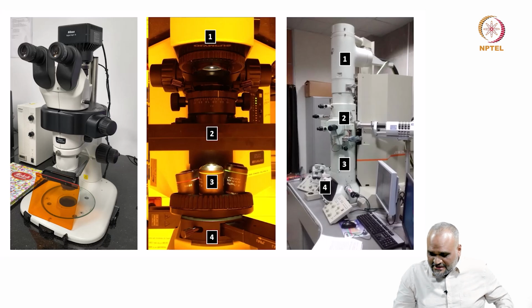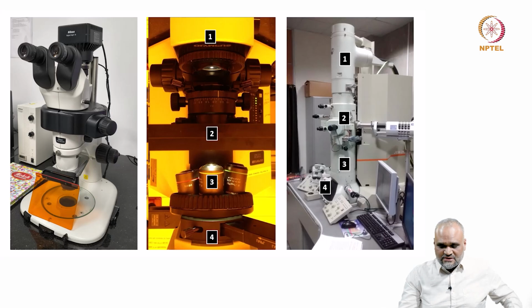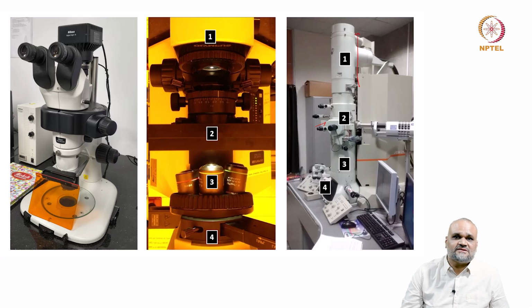Now, going away from that particular deviation, if I go back to this particular image here, the reason why I want to give you this particular layout is that when I want to start imaging, I should bear in mind that I should start by doing alignments in such a way that once a sample goes in, I have to bring the specimen to the right height. I have to start with correcting my illumination system. There are various corrections that you will do. We will go to the microscope and see how these corrections are done.